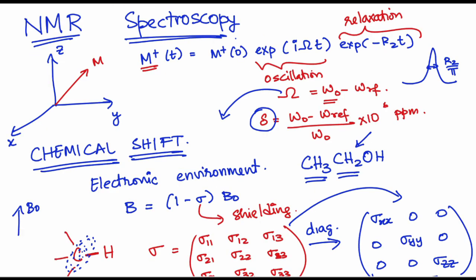To summarize this lecture, I would like to take you back to the oscillation part, where you are able to see when you are able to get the oscillation, you would be able to pick up what are the chemical shifts. And this oscillation also comprises the information that you want to get from scalar couplings. We saw an example of the AX or the IS spin system, and of course solve the other examples for AX2, AMX. In the next lecture, we will be taking a closer look at this parameter, which will be the relaxation parameter.